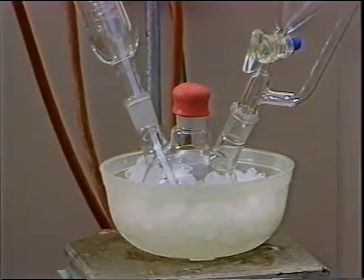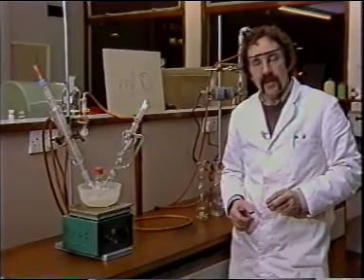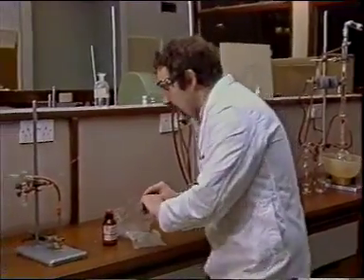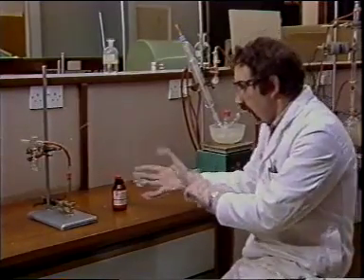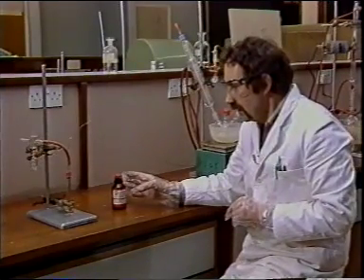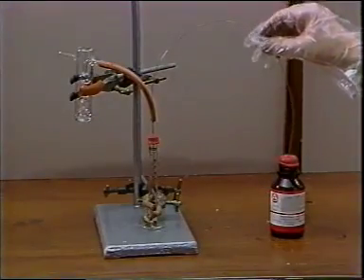I now want to show you how to transfer a solution of one of these sensitive reagents using nitrogen pressure. I must emphasize, however, that this is only a simulation, and I shall be using only solvent and not reagent in this demonstration. If I were doing a live transfer, I would certainly be doing it in a fume cupboard. I use this double-ended steel catheter.